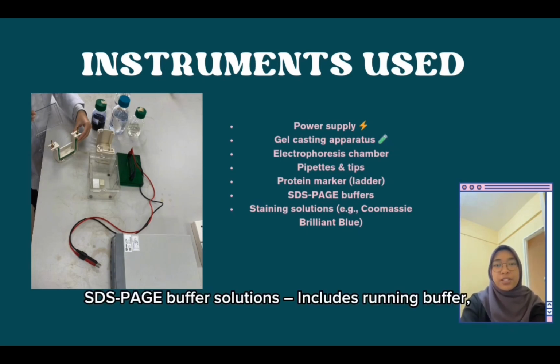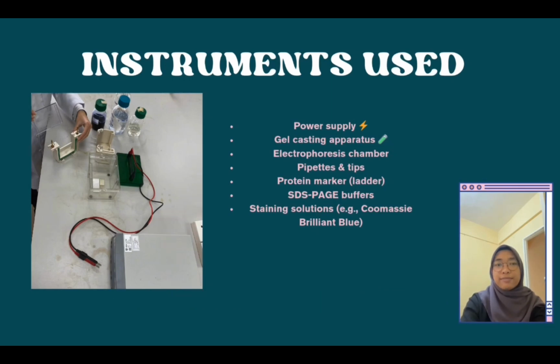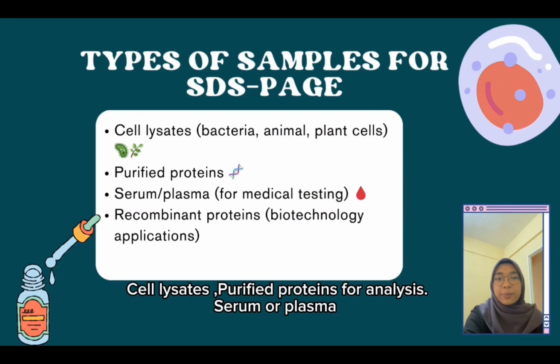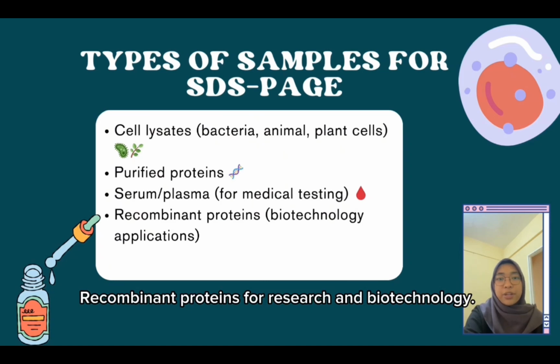SDS-PAGE buffer solutions include the running buffer, stacking gel buffer, and resolving gel buffer, and staining solutions such as Coomassie Brilliant Blue or silver stain to visualize the separated proteins. Protein samples are extracted from various sources such as cell lysate, purified proteins for analysis, serum or plasma used for clinical applications, and recombinant proteins for research and biotechnology.